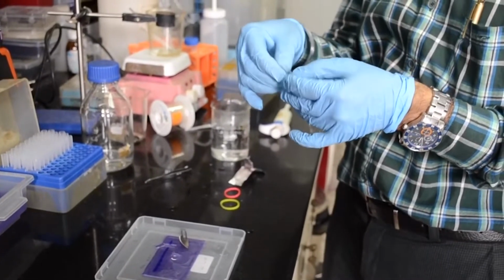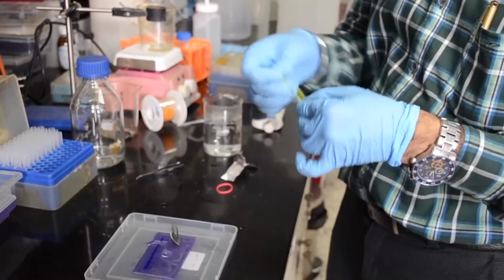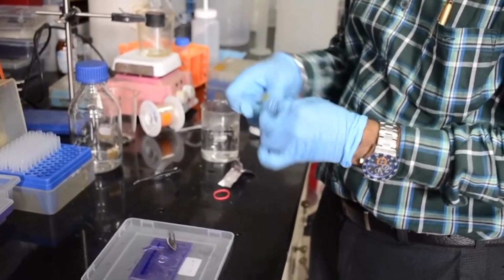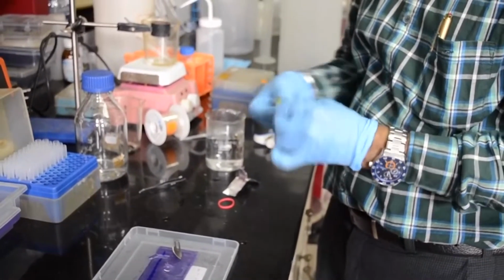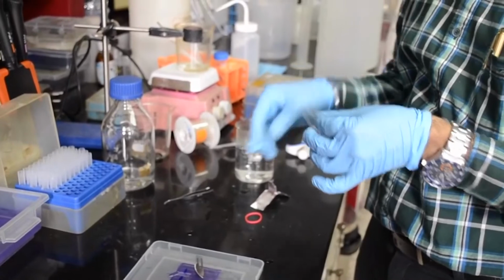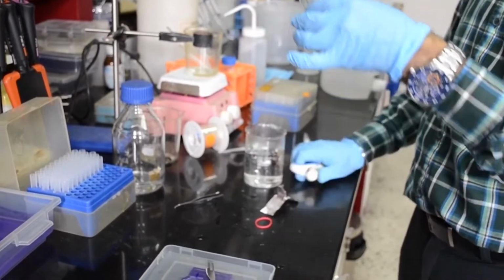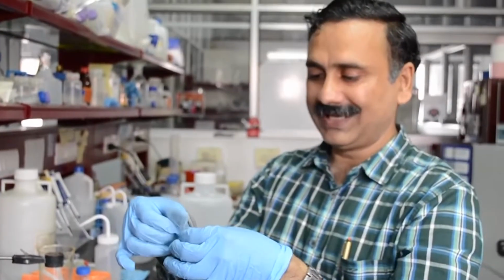so that you do not damage the protein. Once this is put inside, you can put the rubber band on both ends. You have to be very careful that it should not be leaky or cause any problem. When you put the rubber band on one side, and then on the other side, in between you can fill a small amount of the buffer into this, so that your protein will be in the buffer, and by doing so you can also check that there is no leakage.